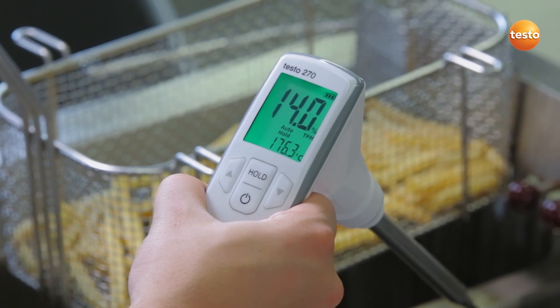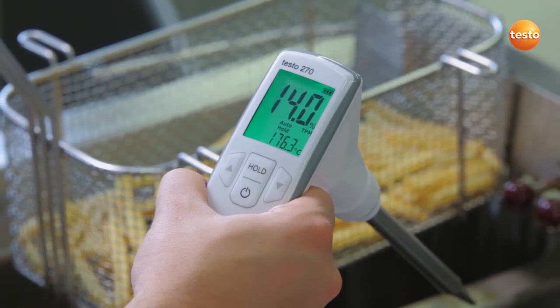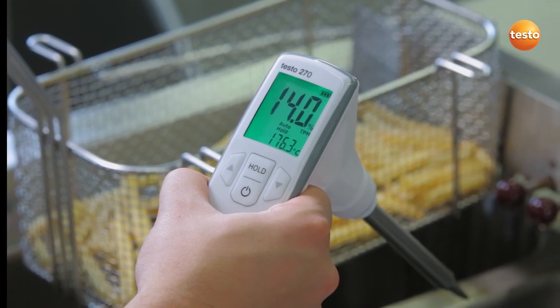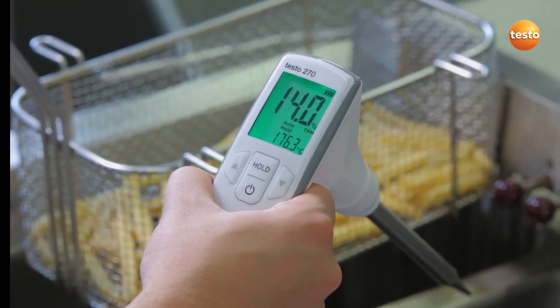This percentage is interpreted by the backlighting of the display in traffic light colors. In our case, the display is green — our TPM value is 14%, so everything is okay. I could now carry on with more measurements without any problems.